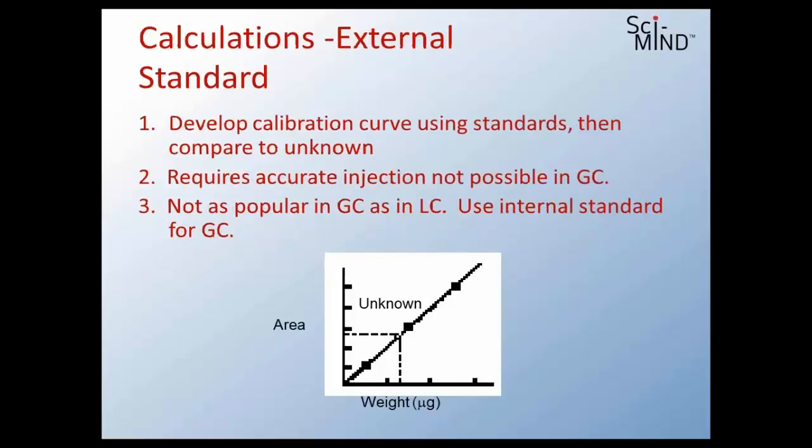Just to remind ourselves, an external standard calibration is just like the calibration curve you did when you first learned UV spec back in school. You ran your standards at different concentrations, you measured the response, you plotted a calibration curve, and out came quantitative data. The challenge we have with this is that it requires very, very good, accurate, precise injection.